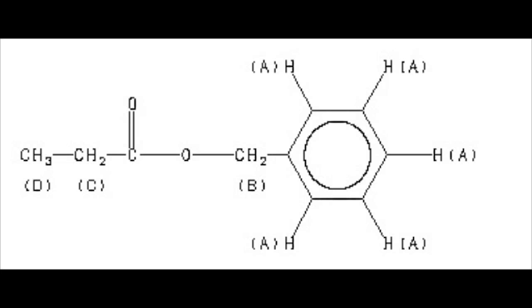So we're going to move on, I think, to one more molecule. Maybe that's it actually already. We'll see. Yeah, I think, okay, that's it for these molecules.